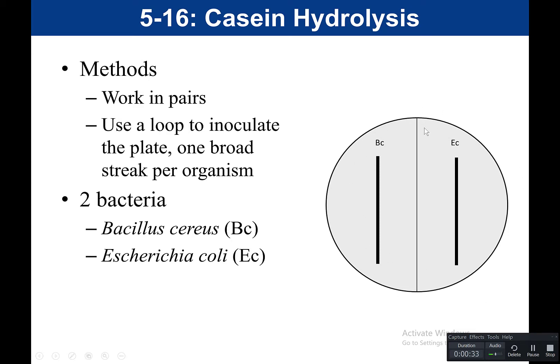On the bottom side of the skim milk agar plate, draw a line to divide it in half. Label one side BC (for B. cereus) and the other side EC (for E. coli). Using aseptic technique with a loop, make one broad streak of B. cereus, flame your loop, let it cool, then make one broad streak of E. coli. Put the plate in the incubator agar side up. This setup is very similar to the starch hydrolysis test.